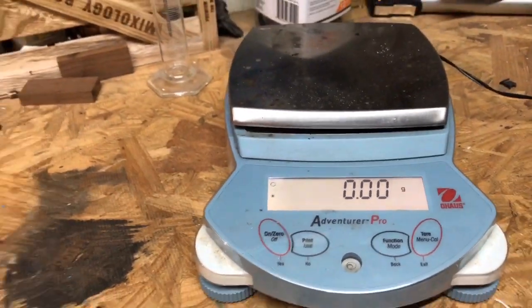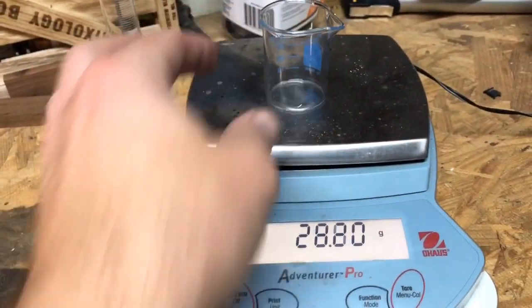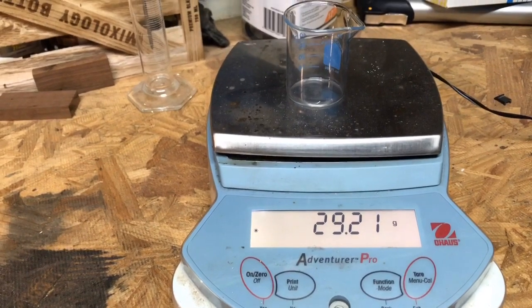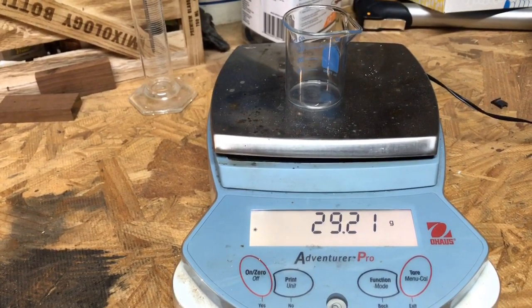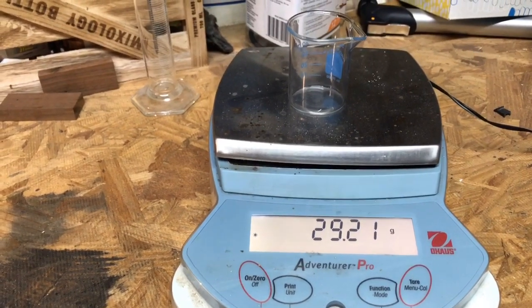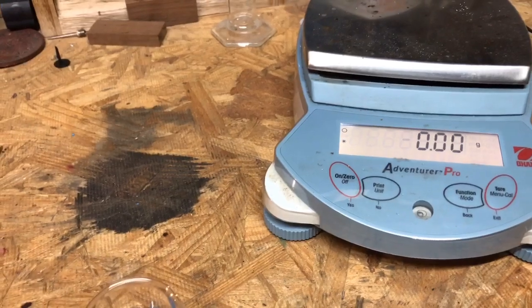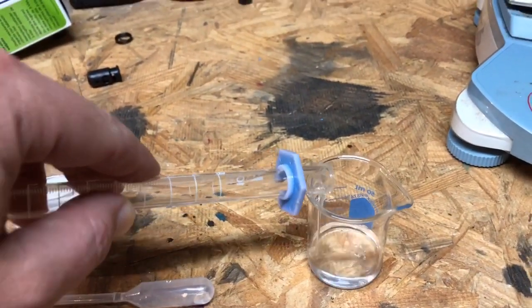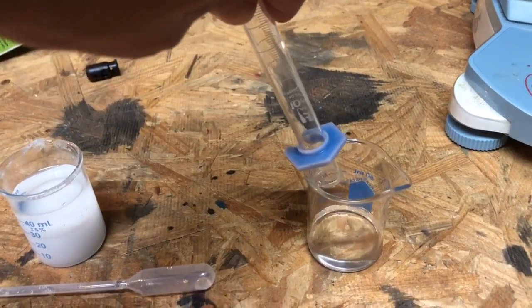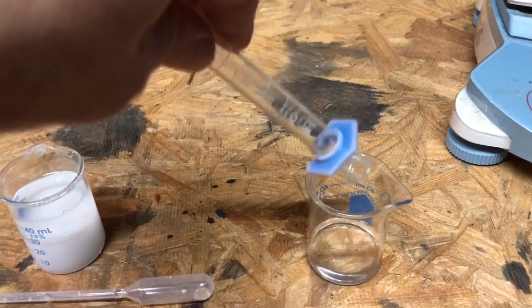So we've got our digital scale and we have an empty beaker here. We're going to go ahead and put that up on the scale. So our mass is 29.21. And now what we want to do is get our saturated solution into our beaker. So we're going to pour that in there. Try and get most of those drops out.